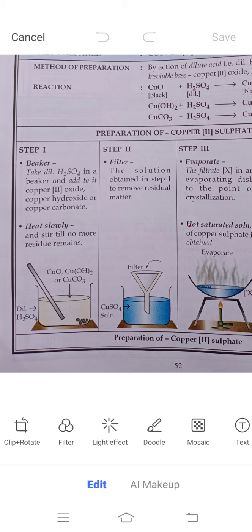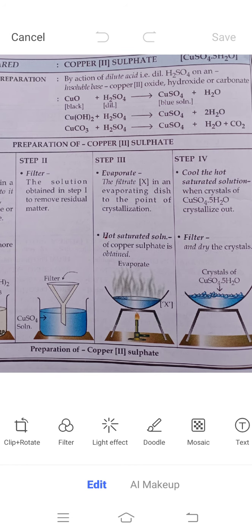In the second step, we filter. After the compound has dissolved, we need to filter the solution through filter paper. When we added copper oxide or copper hydroxide or copper carbonate to dilute H2SO4, the product formed is always copper sulfate. In the first step the reaction occurred; in the second step we are filtering to remove any unwanted residual particles.